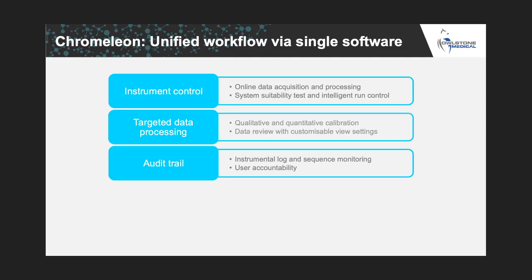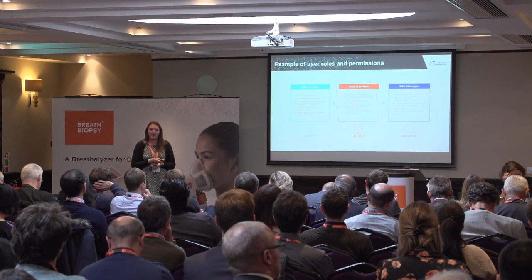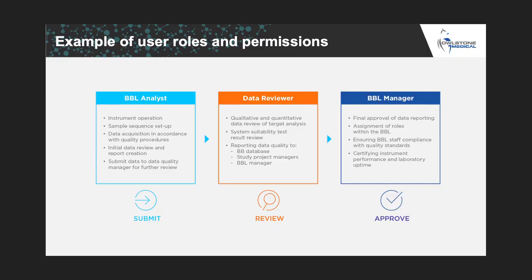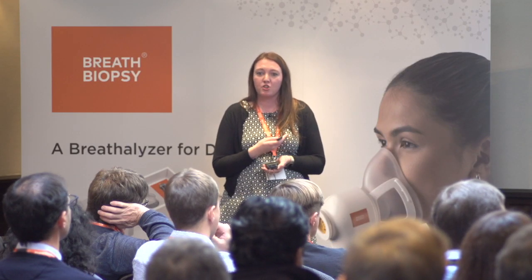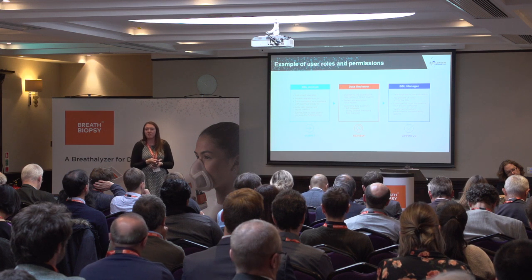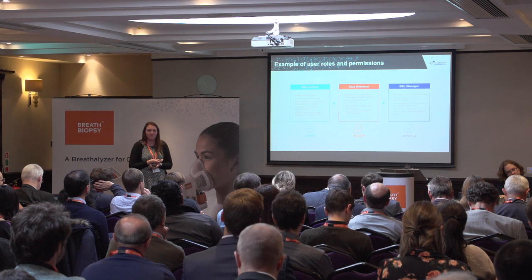User accountability as well. Within the software, we can set up roles and users to say an analyst can process and submit data for review, but a more technical data reviewer needs to look at that data, make sure all the system suitability checks are passed, ensure data quality, and then send that to approval for the lab manager, who in addition would be in charge of the administration console and setting up which users can access which part of the software.